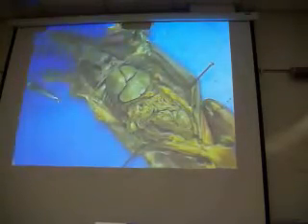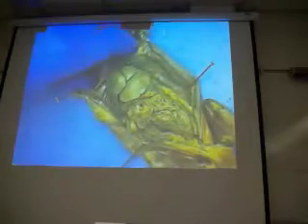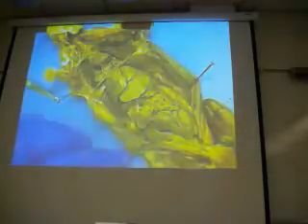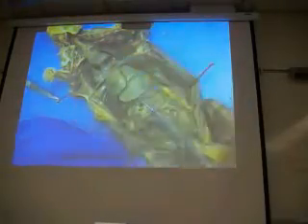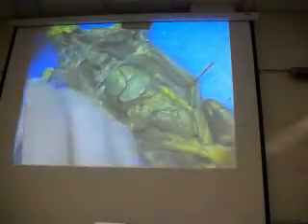So, thoracic cavity, and then you have the abdominal cavity right here. Here's the abdominal cavity, here's the thoracic cavity, right? But just keep in mind that there are a couple other smaller cavities within the thoracic cavity. Right?